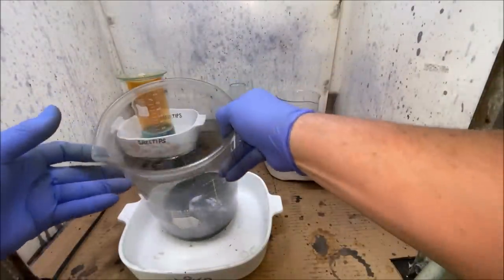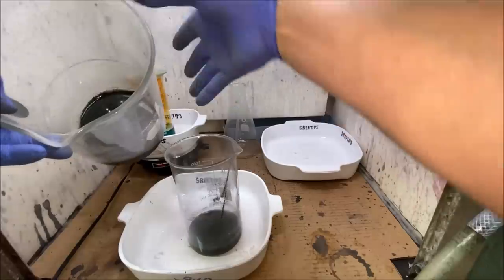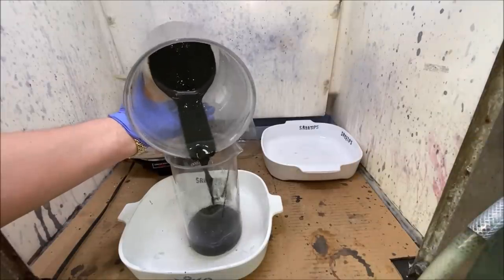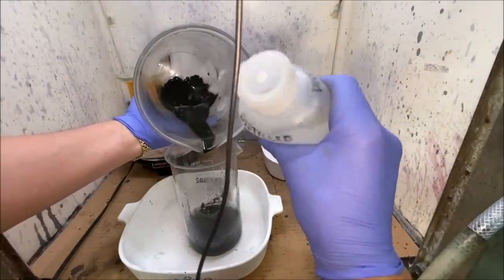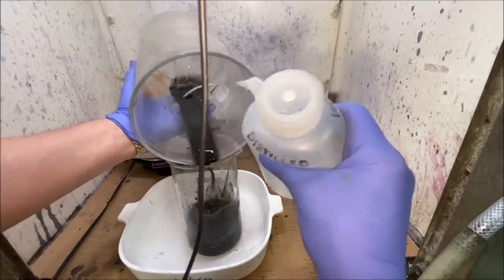Now we'll transfer the solids out of this beaker into this smaller beaker so we hit it with some Piranha solution and then gather these solids up in a filter. And this will be the last of the solids that we have to deal with here.